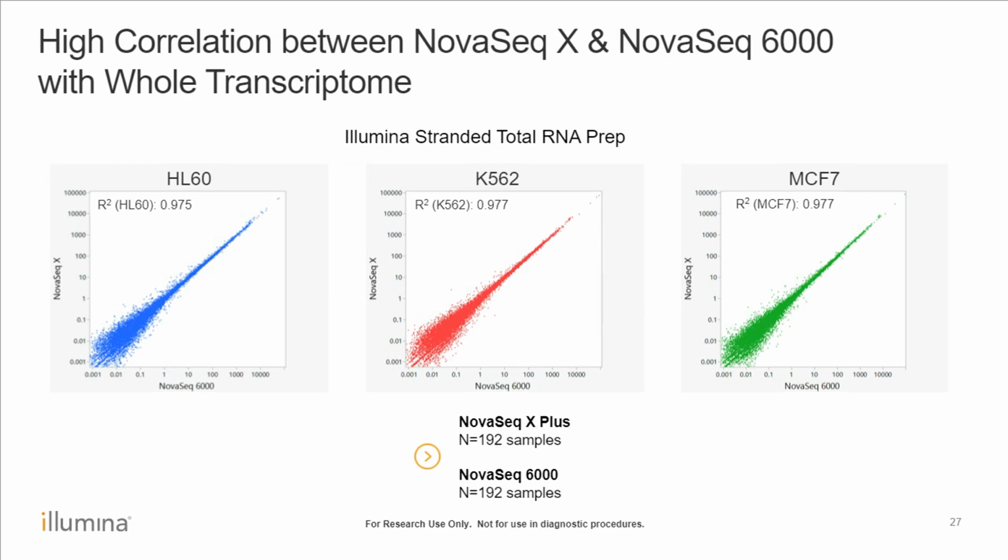And then additionally, if you're interested in seeing what that looks like on a live run, on our BaseSpace Sequence Hub, under the public data section, we have a whole list of runs that are posted there that you could view, like the SAV metrics, as well as run through analyses.